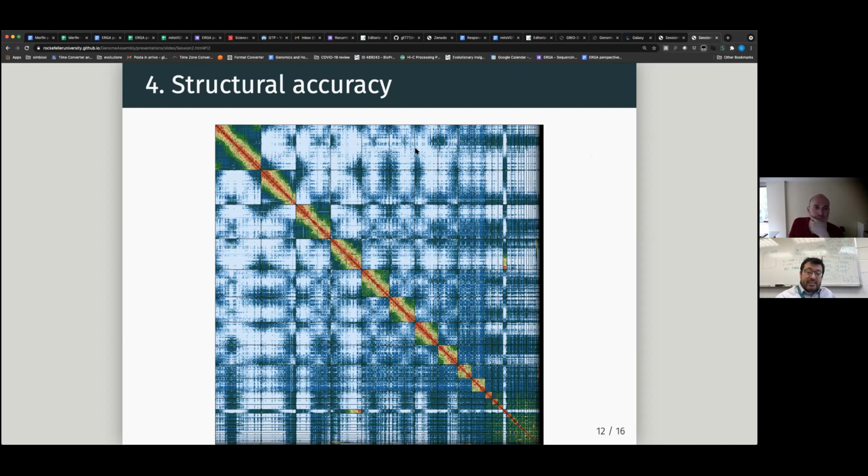Once you have your genome assembled, you can do the same thing. You map your Hi-C data to visualize all the junctions. And here you observe something you expect, where the diagonal with red, yellow, and darker blue has a lot of mapping in these areas, right? Because the diagonal is where all the sequence is contiguous.